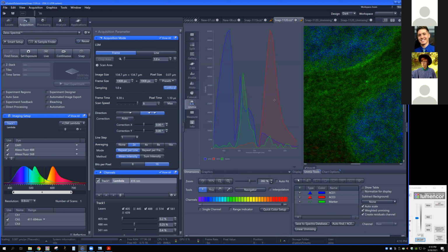So I used to do a lot of brain imaging, and we did GFAP for astrocytes, which is blazing signal no matter what you do, because it is so abundant. The antigen, the epitope there is just everywhere. Even if you back off on dilutions, you end up getting a ton of signal, which can be of value, because what you can do is put it, for example, on a fluorophore or on a laser line on a channel where you don't have optimal excitation.